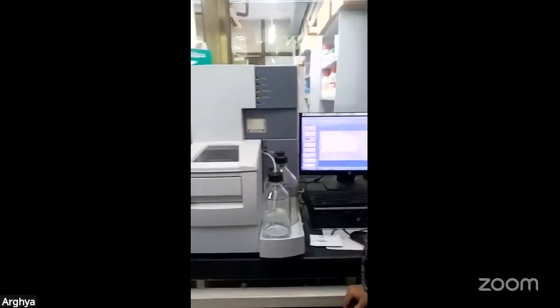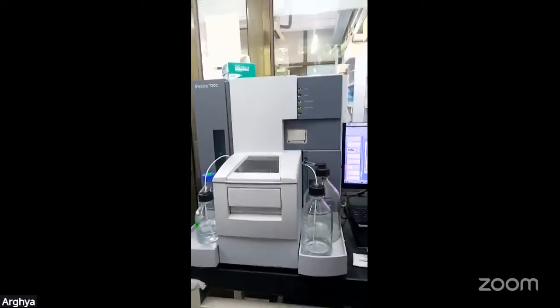Hello everyone, this is the Biacore T200 from Cytiva. We use the Biacore T200 to study biomolecular interactions. We study different kinds of biomolecular interaction, like protein, small molecule, protein with DNA, drug molecules, all sorts of biomolecular interactions. We find KD on the basis of the rates of association and dissociation.